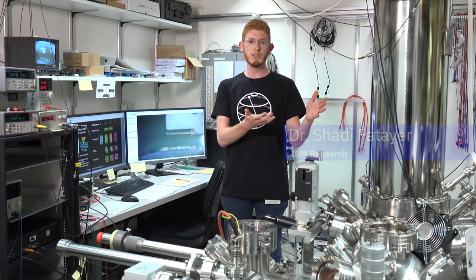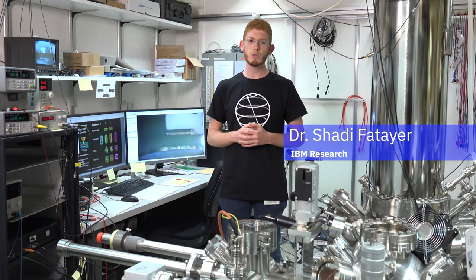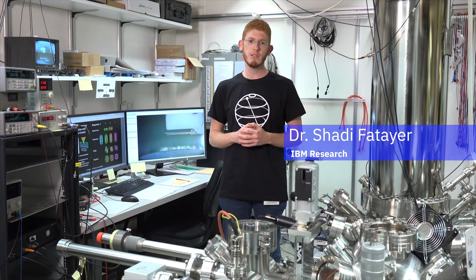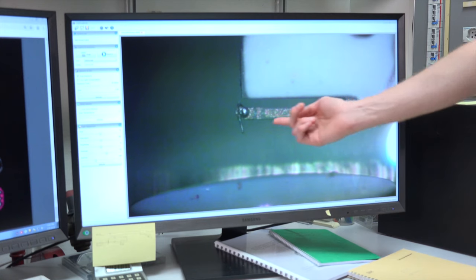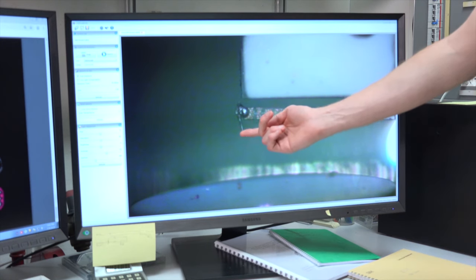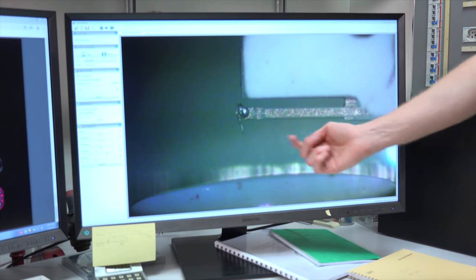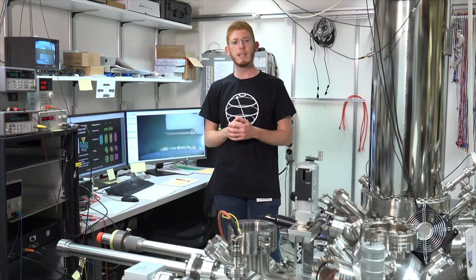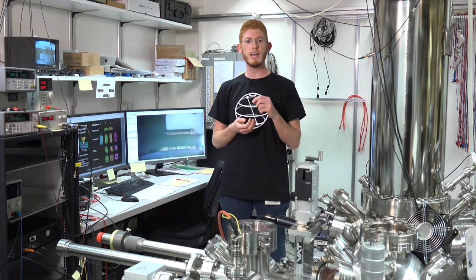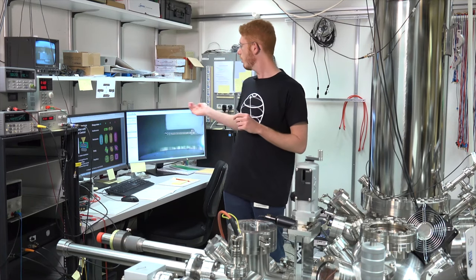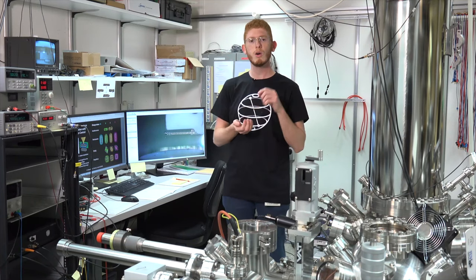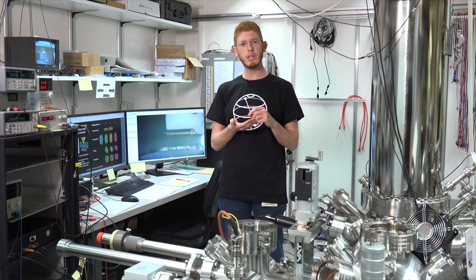This is the instrument that we used. It's an ultra-high vacuum, low temperature atomic force microscope. This is the cantilever that we have in our system, which is a Q-plus sensor. With that, we functionalize the tip of our sensor with a CO molecule.